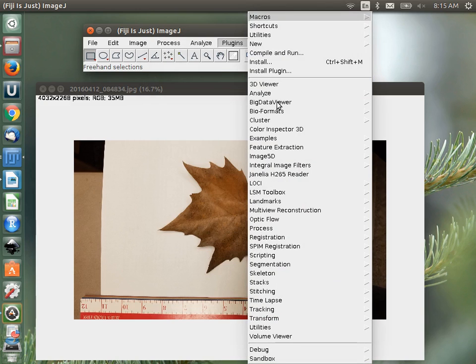Plugins are smaller programs implemented in ImageJ that people have made for specific purposes. One nice thing about Fiji, which is a batteries-included implementation of ImageJ, is that it comes with lots of plugins out of the box that you will already need. If you just get straight ImageJ, it doesn't have any of these — you have to install your own plugins.